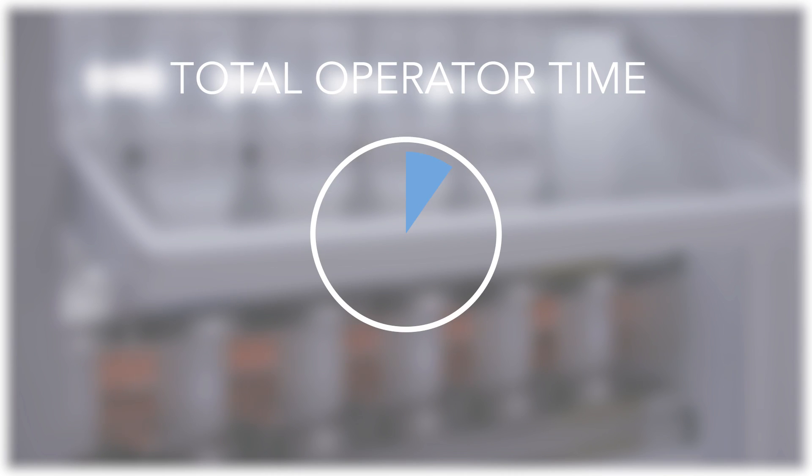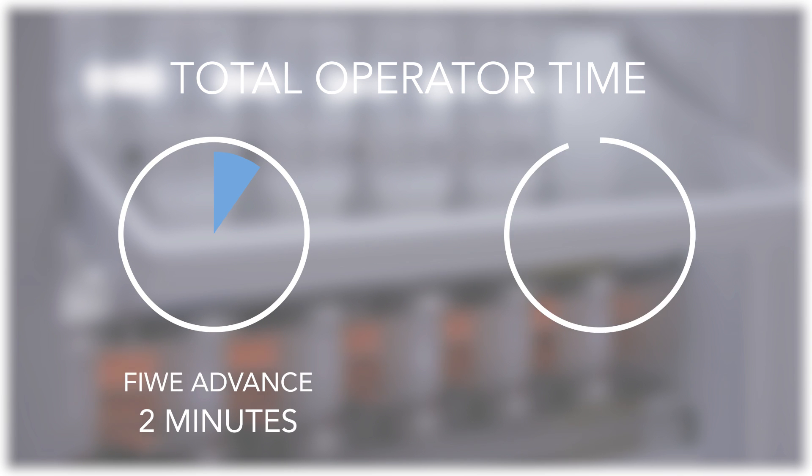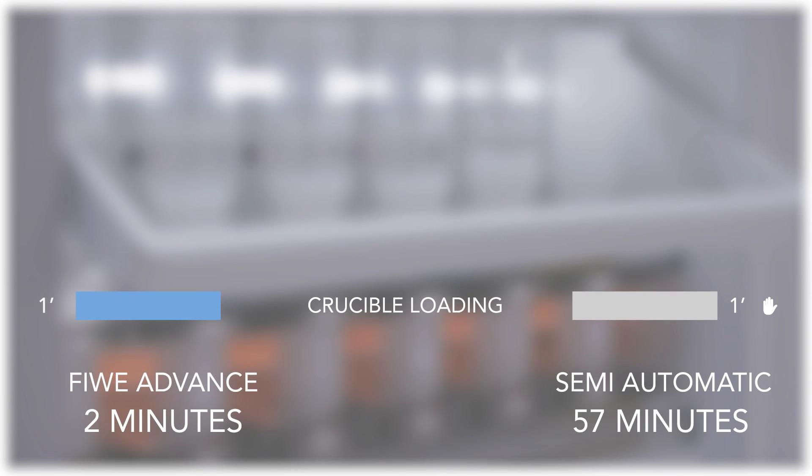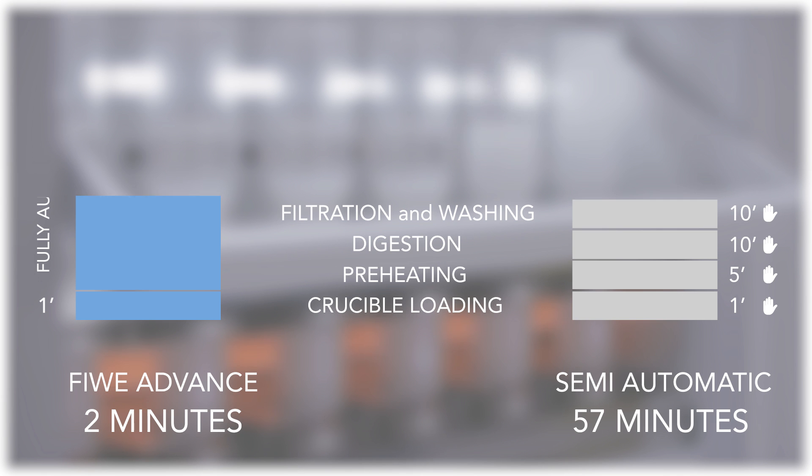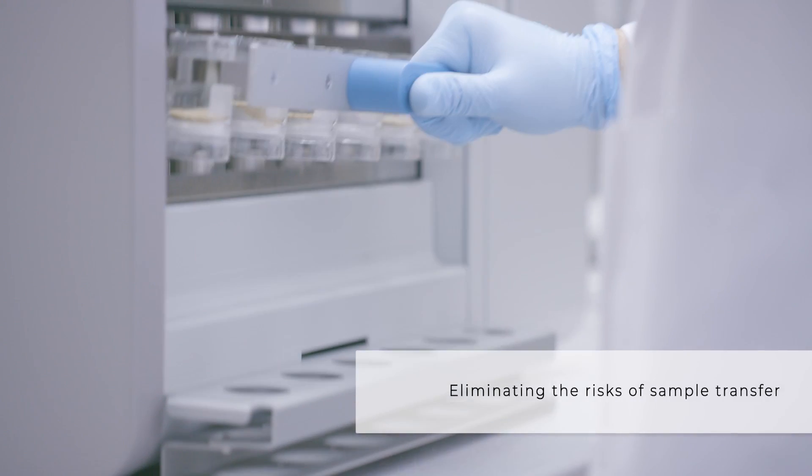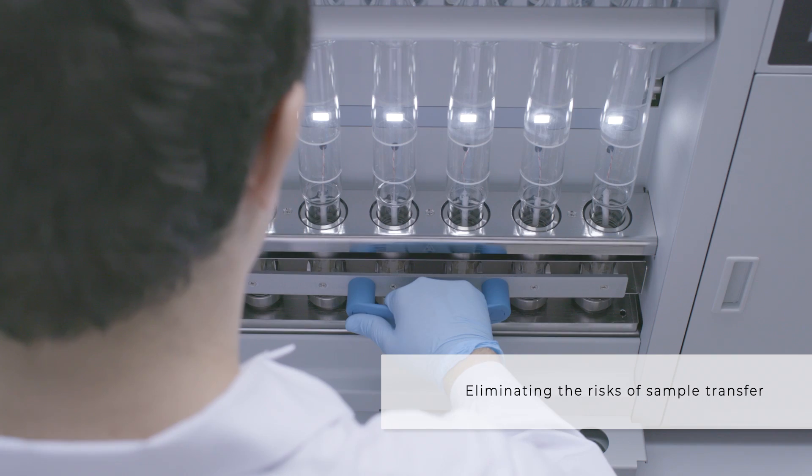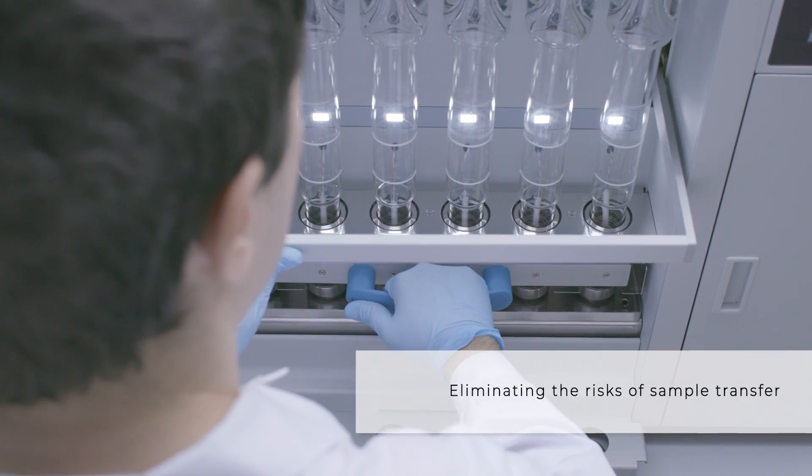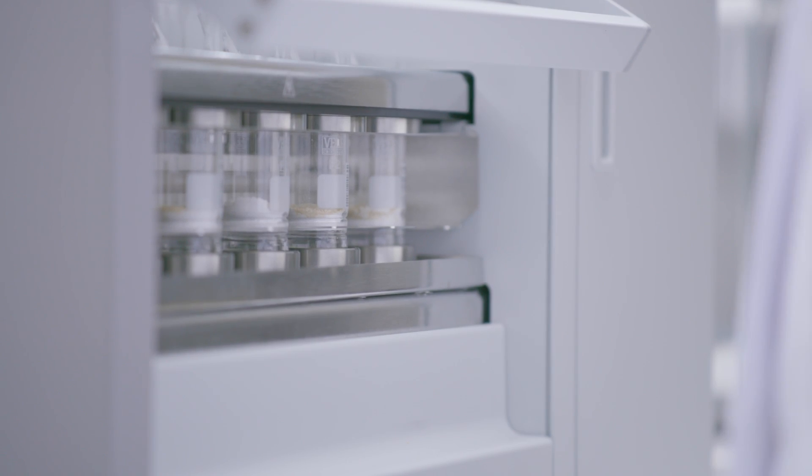The Feeway Advance is a load-and-go analyzer requiring less than two minutes of the operator's time. All the fiber analysis steps are completely automated and standardized for maximum analysis repeatability. The sample always remains in the crucible, eliminating any risk of errors related to sample transfers.